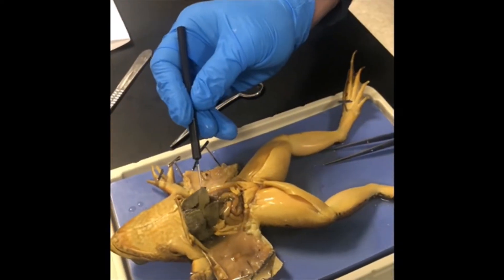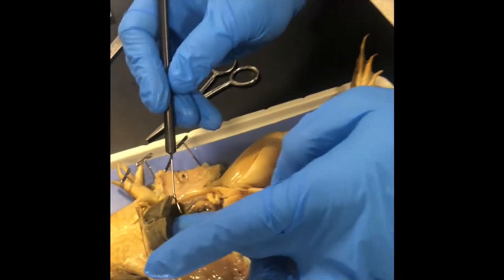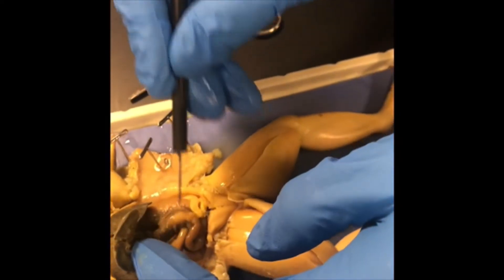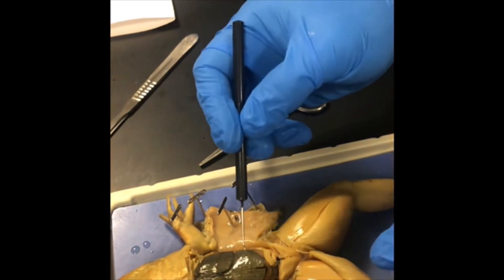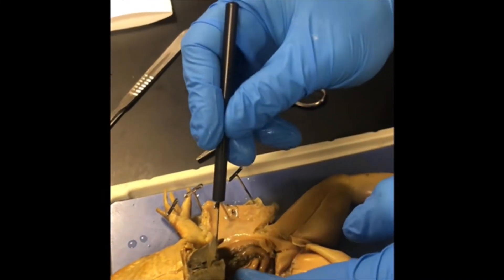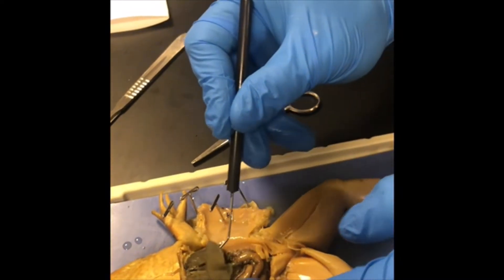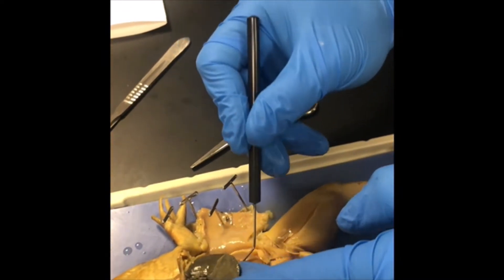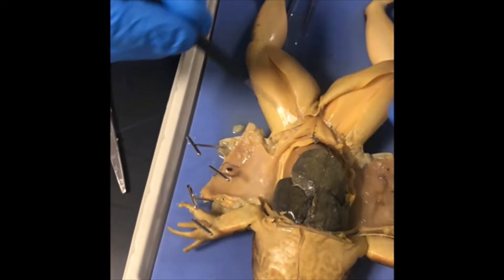Observe the frog's organs. Move them very carefully to get a good observation, but do not damage them. You may also use your fingers — just be careful, as the probe is very sharp and you don't want to poke through your gloves. Be very careful to keep everything in place; we don't want to mix up the organs for other groups.